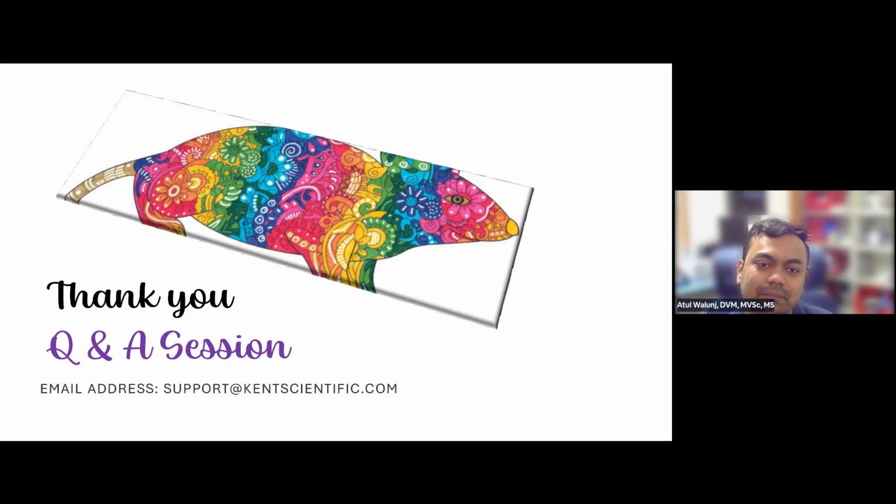How effective are electric heating pads at deep tissue penetration? Do you have any information on that? Yes. Based on our internal as well as customer support and research data, we have seen that electrical heating pads provide superficial or skin-only warming. They do not have deep tissue penetration. They can, if you crank up the heating setting.